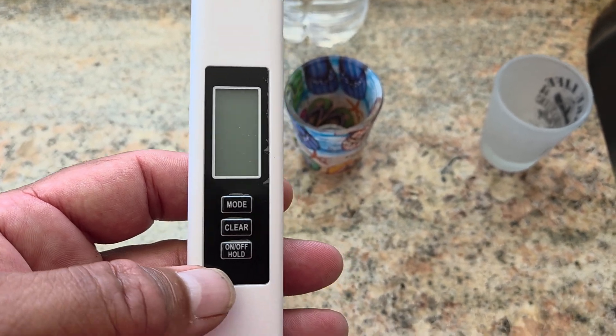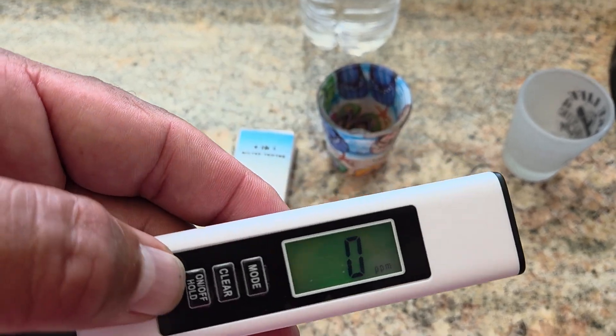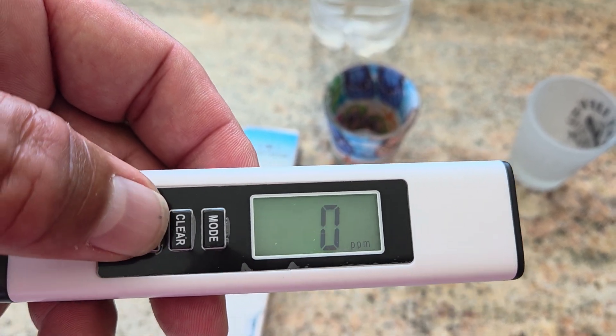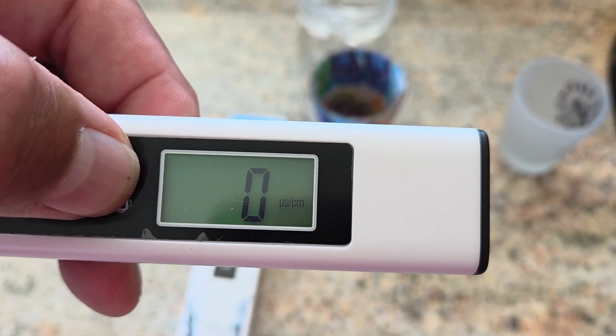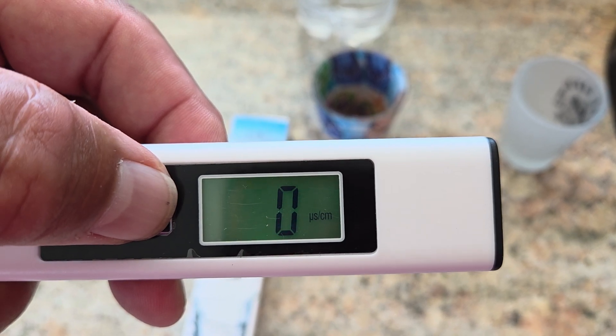Basically, it's just a nice little gadget too. So you turn it on — the LED's nice, it's bright, easy to read, very easy to read. And you have clear and mode buttons. The mode goes from parts per million to the USCM.